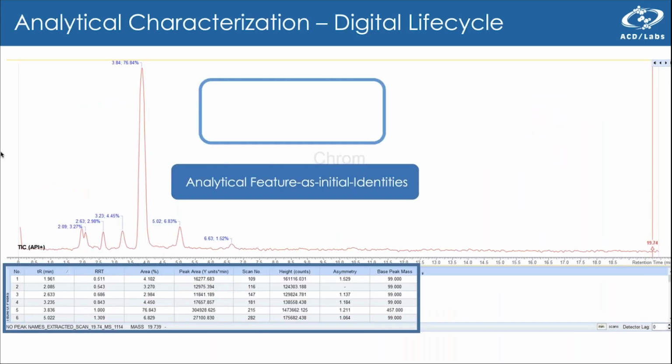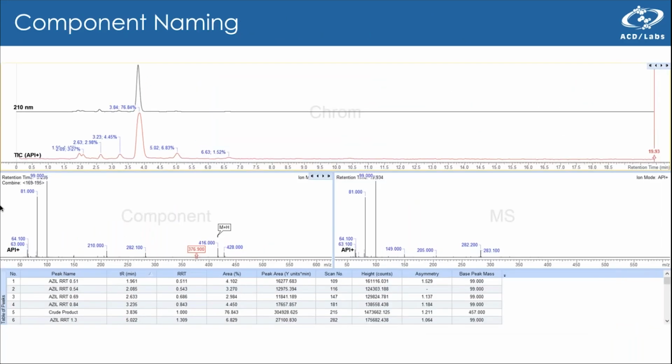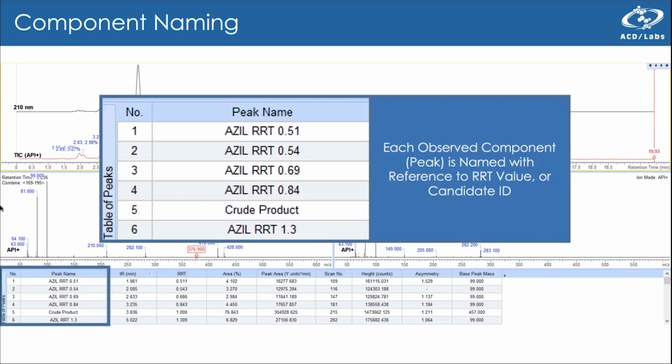Thinking about that process in some detail, you start in the original chromatograms with peaks, right? And the only attribute you have in the first run or characterization step is relative retention time, and you build that up over time. So as an example, collecting spectral information and associating that spectral information, even when it's still nominal identity information like relative retention time, being able to build that up in a life cycle type fashion is often important.